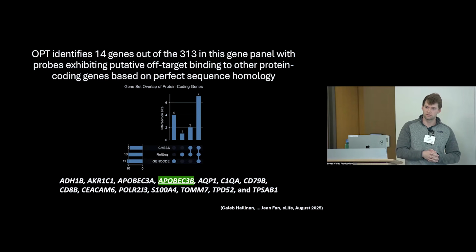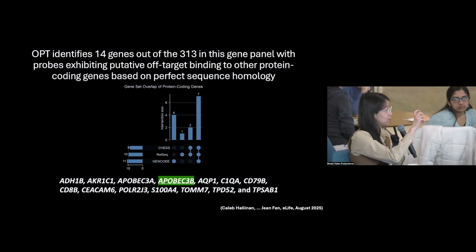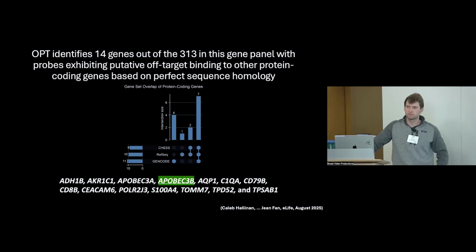For people online, this is the difference between Xenium versus MERFISH. I think you were thinking of MERFISH, where each probe has one readout sequence, so you end up having 40 or so probes per gene. If any of the probes misbind, you would just get a misreadout of 2 of the bits. But in Xenium, the whole barcode sequence is encoded in each probe. So actually there are only 2 to 8 probes per gene as compared to MERFISH, where there are around 50. Thank you.